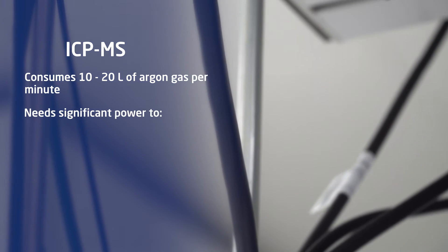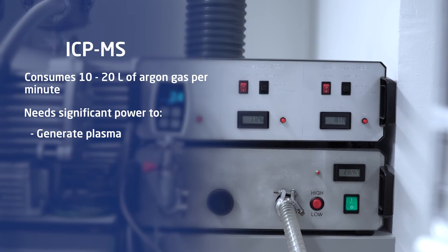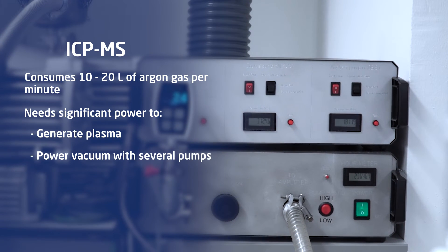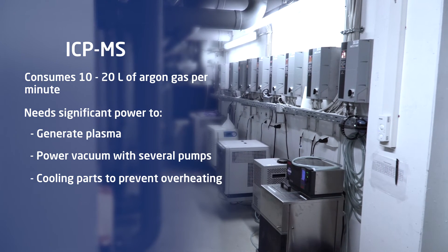It needs significant electrical power for generating the plasma, keeping the vacuum against a strong gas stream with several pumps, and cooling its parts to prevent overheating.